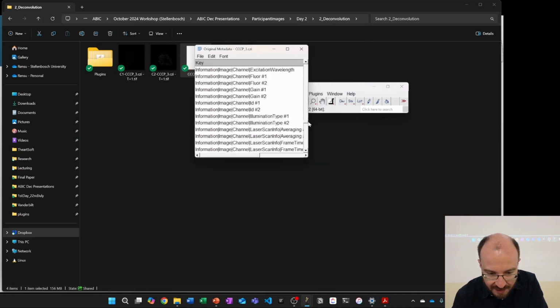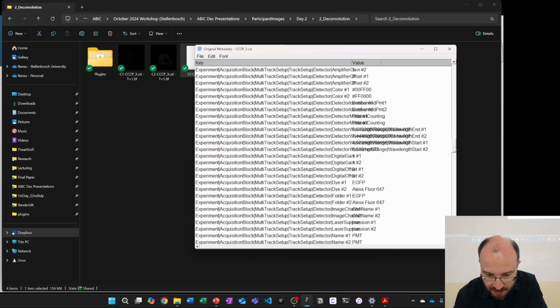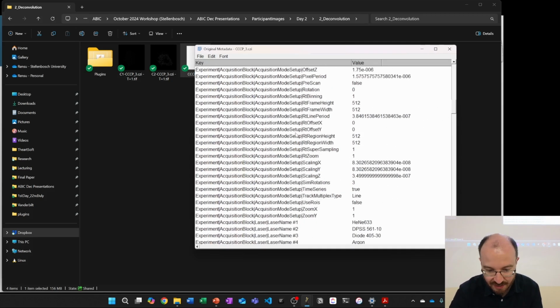So here's all the information of the sample that I just acquired, or that I just put into the software. Now, as I also showed you yesterday, this is not very nice for me to work with. You can extract information directly from this. You can use macros and stuff like that to say, read from this file, find the specific word, and then extract the data that's sitting behind it.